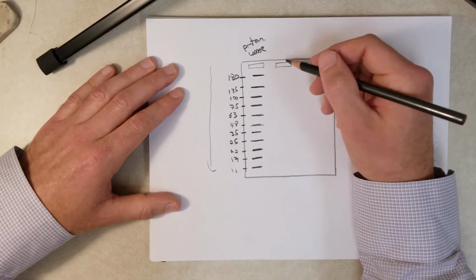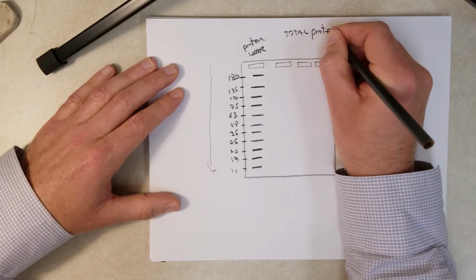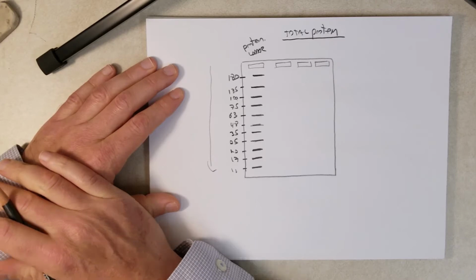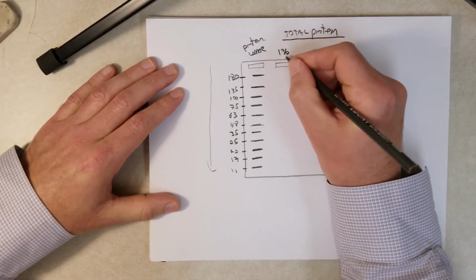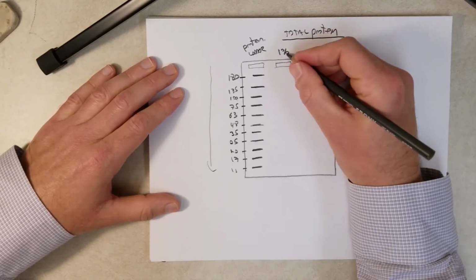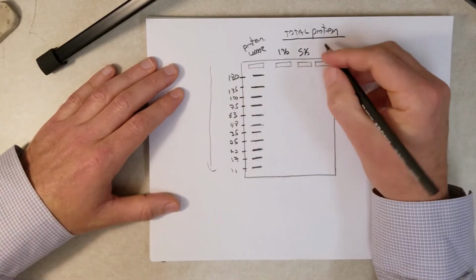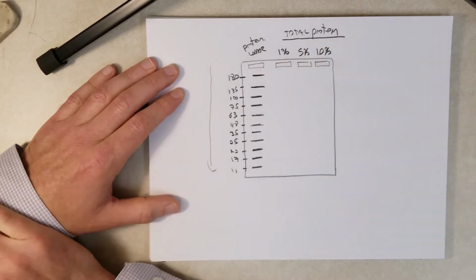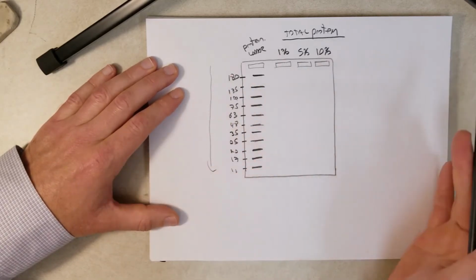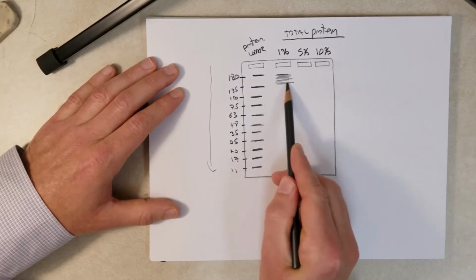Now let's say we loaded equal levels of total protein that was isolated from our host cells carrying the transgene. And here, this is where we load protein from the cells grown in 1% glucose. This is where we load protein from the cells grown in 5% glucose. And this is where we load protein from the cells grown in 10% glucose. And we could stain this gel with a dye that binds proteins. And what we would see is something like this.